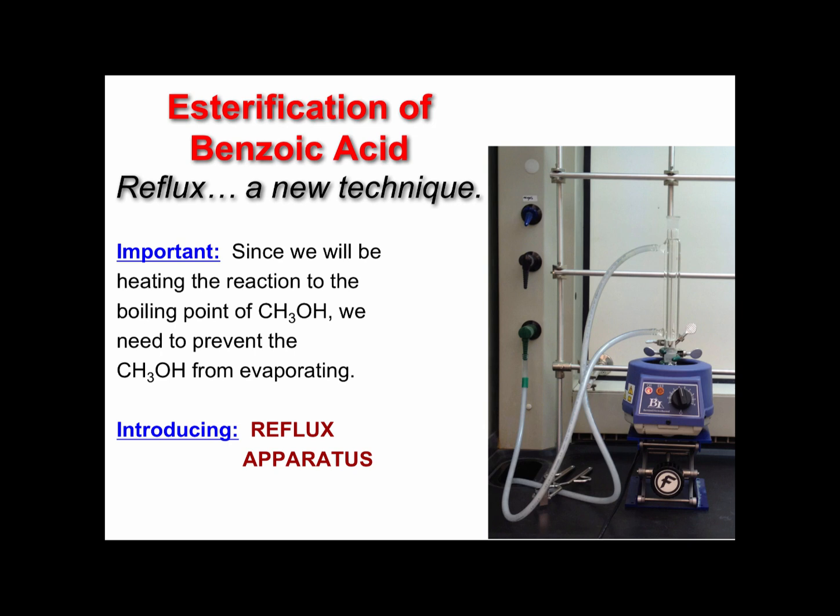Okay, how do we do this? We want to heat up the reaction mixture. The reaction mixture contains your benzoic acid and methanol. But methanol has a pretty low boiling point. So if we're heating this up, wouldn't the methanol evaporate? And the answer is, yep, it would. If we don't do something to prevent it, it's going to evaporate.